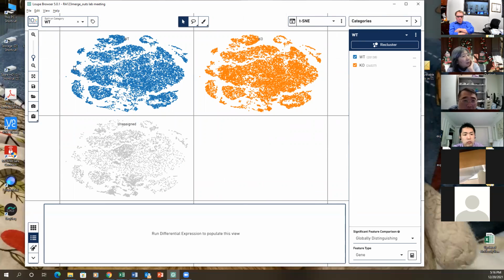So you see one is WT, another knockout, another unassigned. Unassigned, these are doublets or double negative. You can gate all the unassigned into a third group. Maybe we don't want to because they're overlapping. That's not too good. So I think really just these two. It's better to make this unassigned, just draw the gate and put a third group. You have WT, knockout, and then the third group you can name.